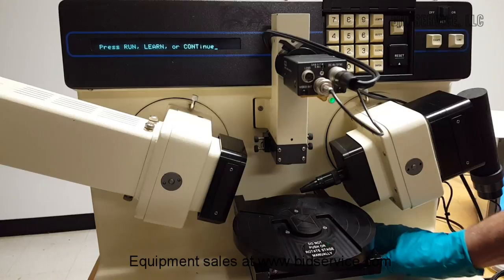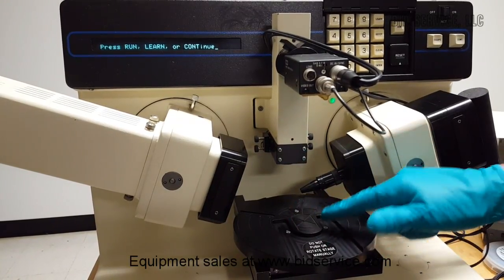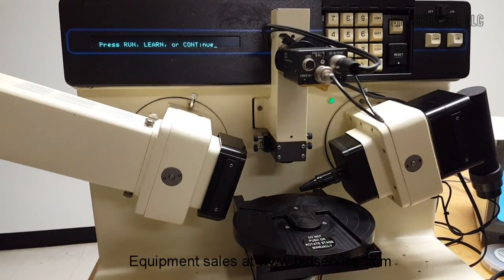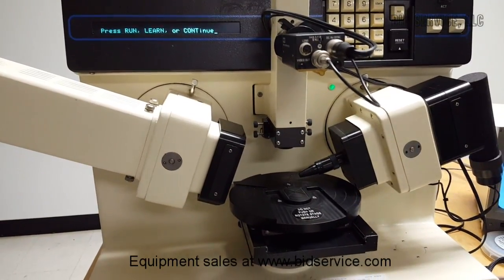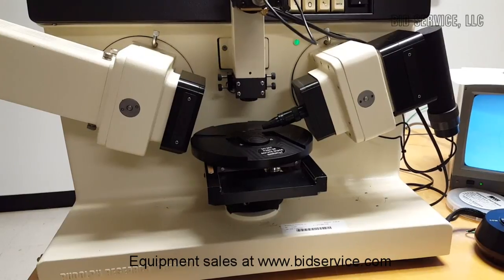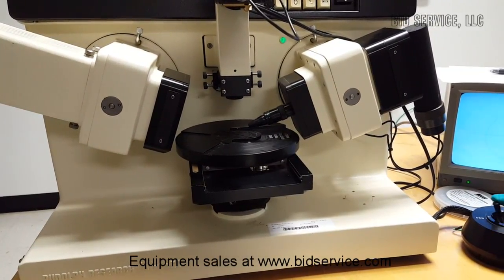If necessary, the sample could be held using a vacuum pump. The vacuum connection is a 1/4 inch line on the back, and I'm going to operate the joystick to move the stage in, and then I'm going to demonstrate how the stage rotates.